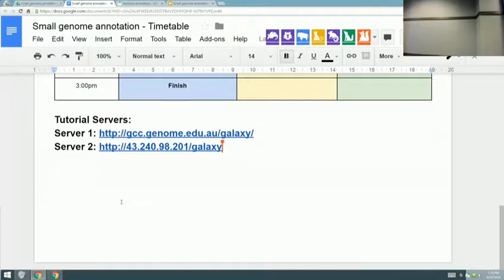I'm looking at the SPAdes manual. What I can find is references to doing automatic k choice in the future. Automatic k choices in SPAdes: you just don't specify. They just leave it out. It uses this wrapper. Just change that. You just don't put the k value, you leave it off completely. You have to kind of do a double wrapper option. This is a full quote.